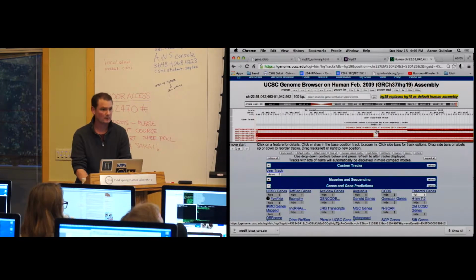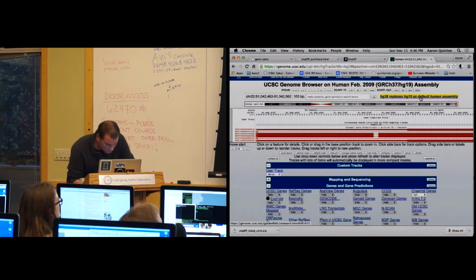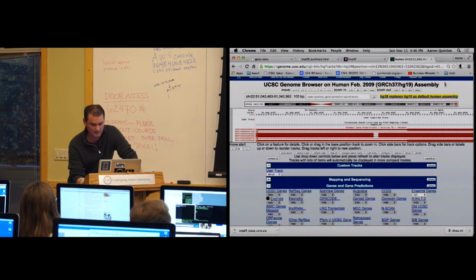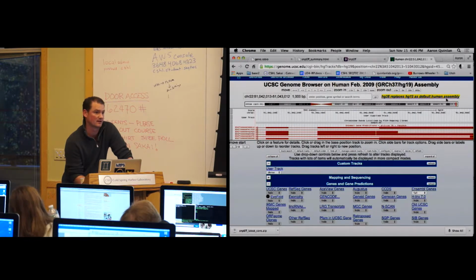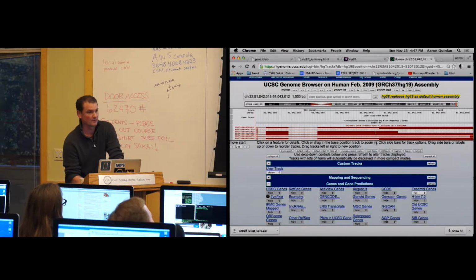Okay. Do we really think that's an intron right there? We could zoom out and see. It's just so small, isn't it? Well, I'm only looking at a 100 base pair window, so we'd have to zoom out to give some more context. Let's go out to 1,000. Well, it's predicting like a 2 base pair intron right there. Ah, yeah, good question. I see what you're saying. I thought you were talking about the second line up from the bottom. Yeah, that's the prediction, but it doesn't really make a lot of sense, does it? And therein lies the reason why you have to inspect each of these candidates by eye.